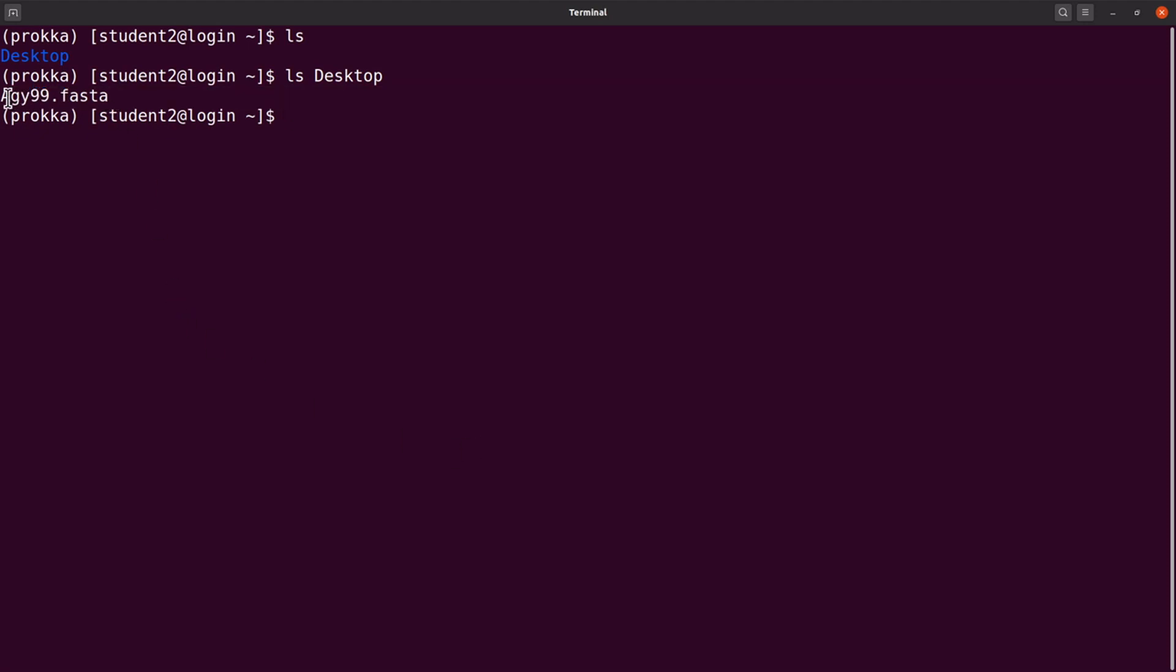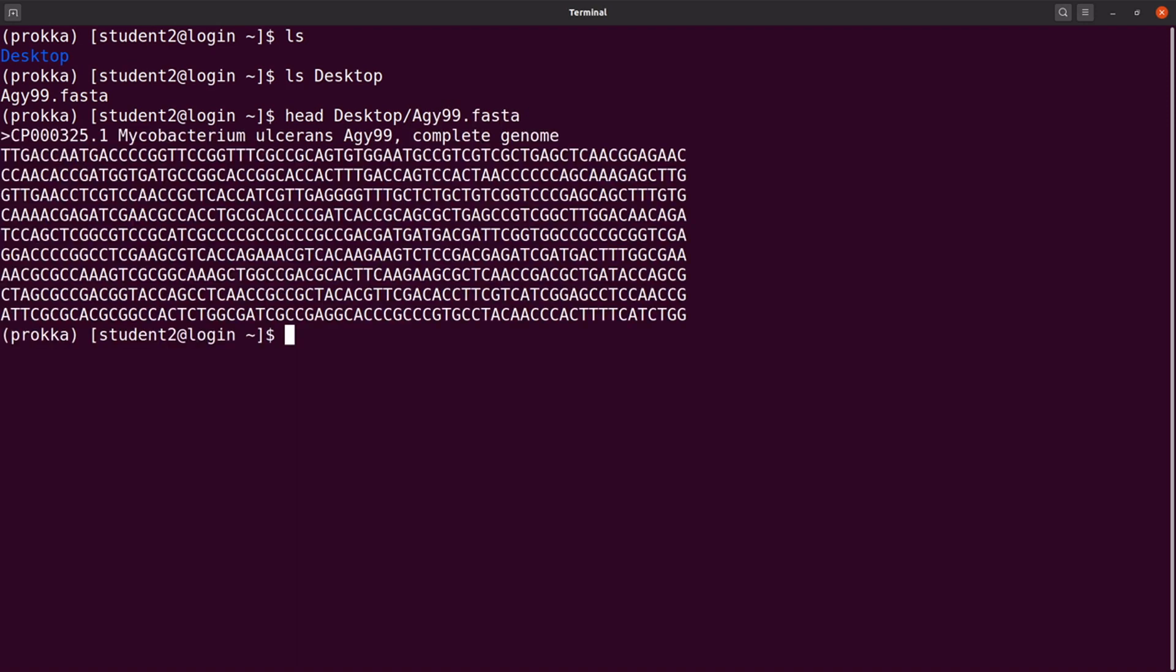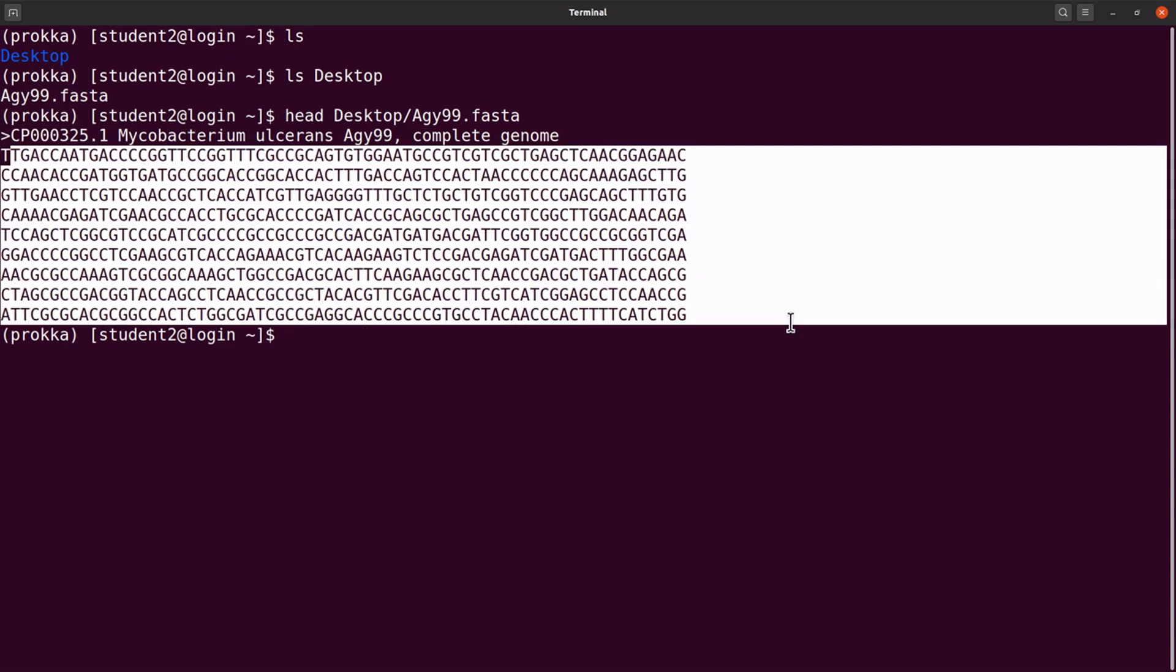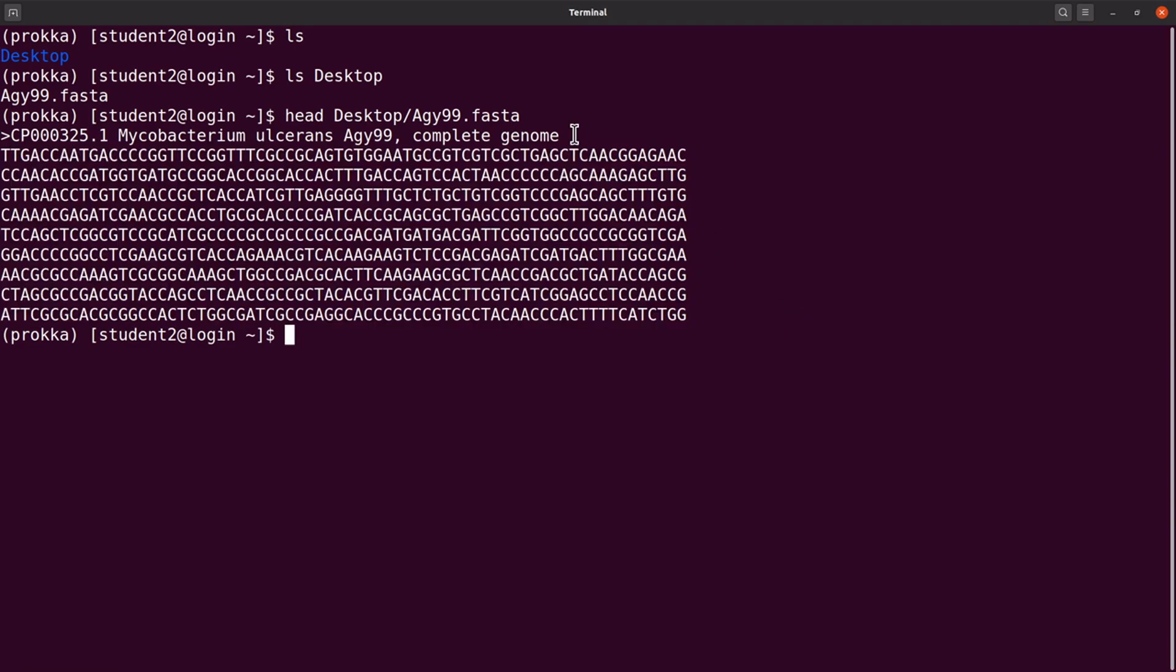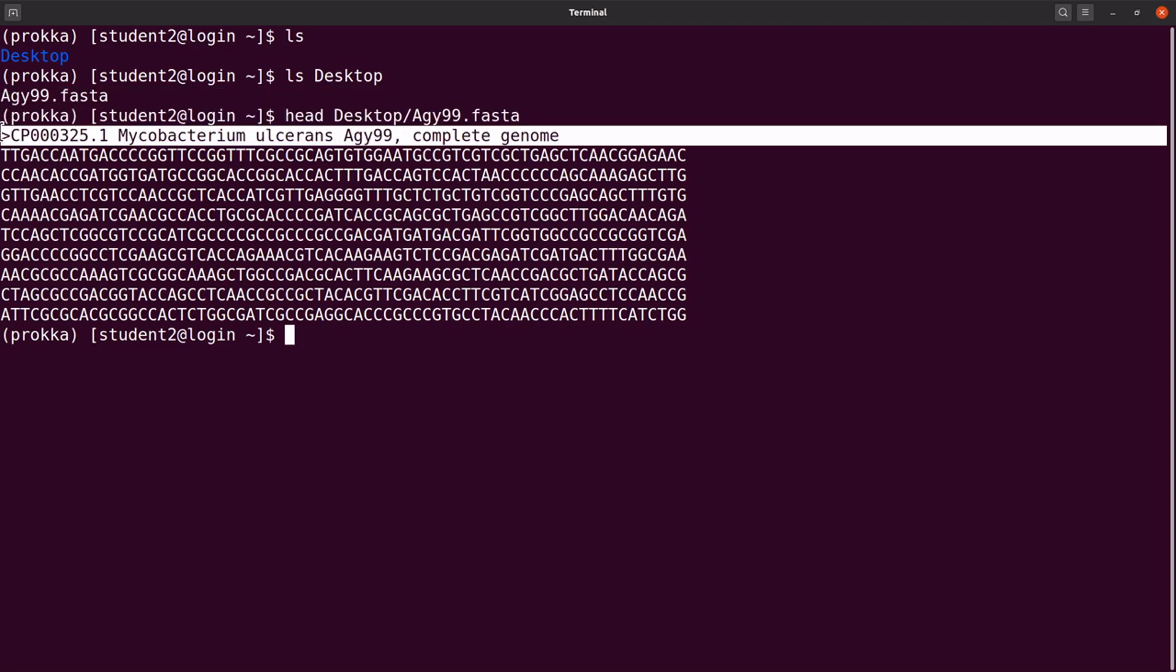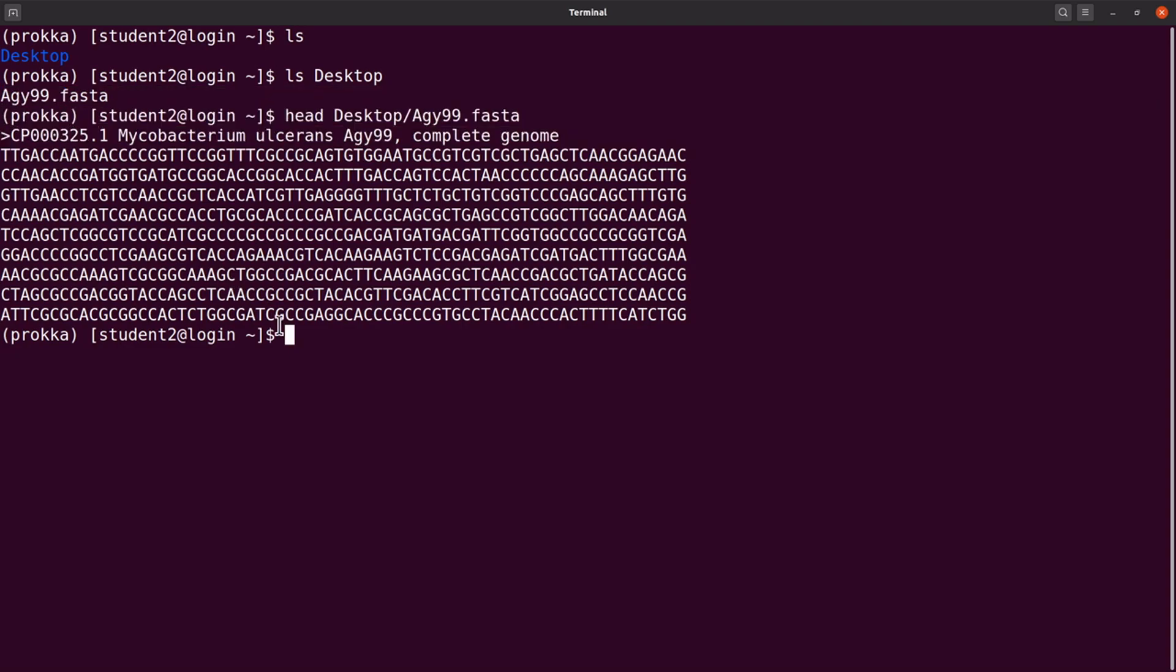We have it here. So let's quickly display some lines from that particular file. I will say head desktop slash agy99.fasta. So we have some lines displayed. That's the sequence, some of the sequences, and we also have the name displayed here. So now our file is ready for use.